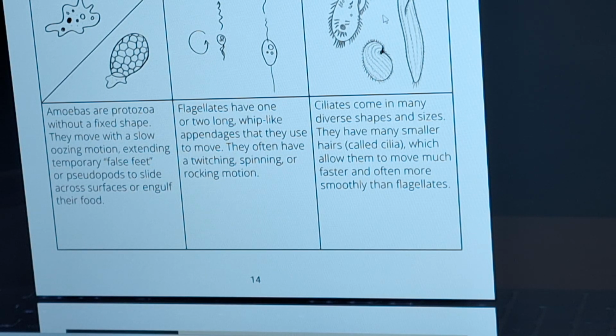Then there's ciliates. Ciliates, if we see up to 3 to 5 per slide, we're all right. If we see more than that, it's a sign of low oxygen conditions. We don't want to see that, but we don't mind seeing a few. It's a sign that you're in between, and the edge is where it's at. That's where the most diversity comes from. So a few per slide is not bad.